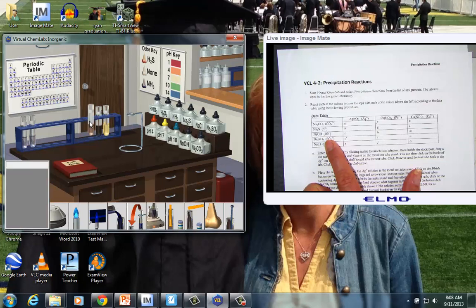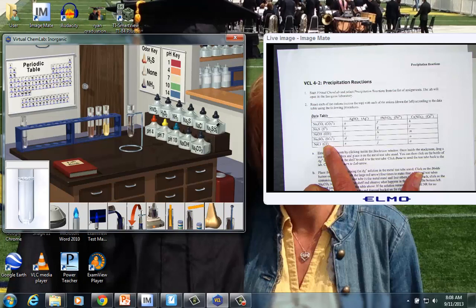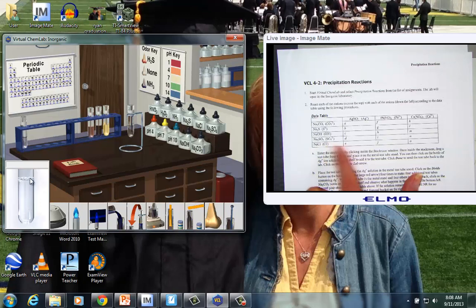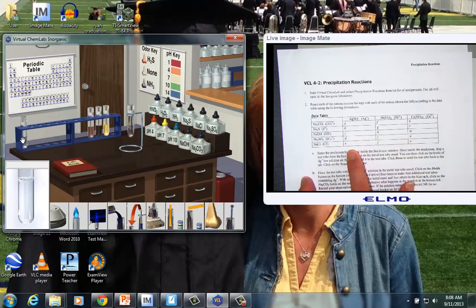When I come to the next test tube, which is Na2SO4 with silver nitrate, that is sitting here. Notice what happens? Nothing. This, to me, is a negative test. No chemical change occurred. So for the letter D, I'm going to record no change, just a physical blend, but no evidence of precipitation. And that will happen. That's why we're testing, to find which ones, indeed, do precipitate.